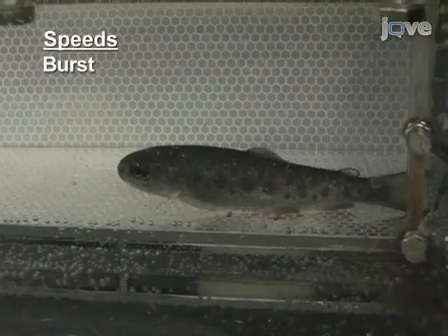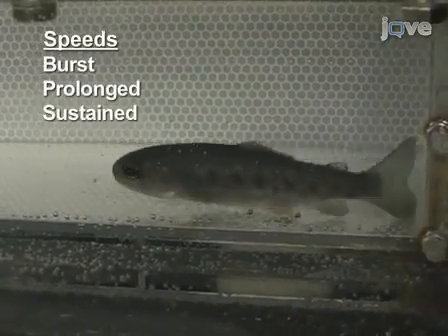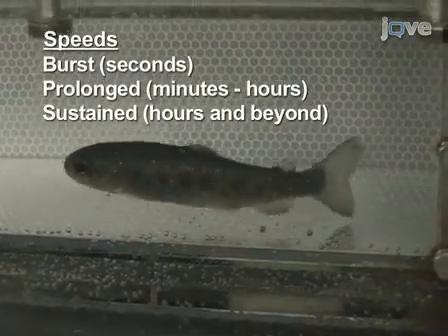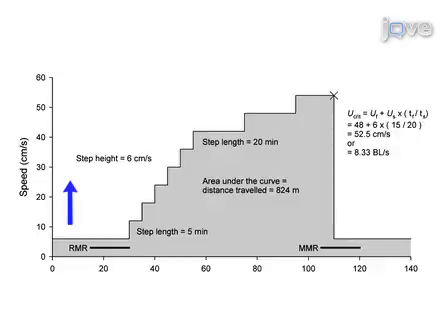The most common way to characterize fish swimming performance in a swim tunnel is by the duration for which it can be maintained. The slower the speed, the longer the fish can swim, and vice versa. Speeds are generally referred to as burst, prolonged, or sustained, which correspond to durations of seconds, minutes to hours, and beyond. To determine these speeds, fish are subjected to user-defined steps consisting of set height, i.e. water flow speed increases, and length, i.e. step duration. Maximizing step height and minimizing step length will capture the greatest burst speed, while doing the reverse will capture the greatest sustained speed.